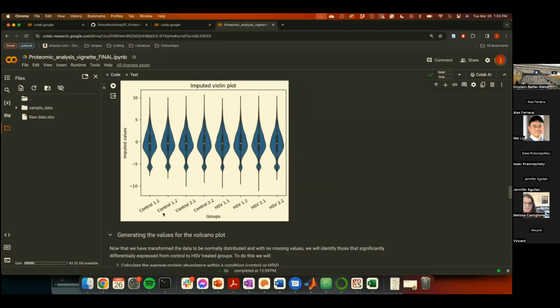Is that right? Yeah, I completely agree. Just as a tiny additional note, when we impute values, we're always making up numbers, right? So whatever number you put there is wrong. So now the question is, what is a wrong number that represents more or less the enrichment that you want to calculate?